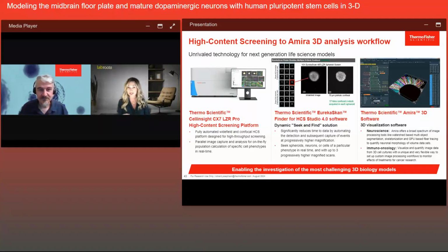We have time for one more question. Is there a recommended optimal size of neuroorganoid for passaging and imaging? So for these organoids, I never passage them. From the moment they're formed as a spheroid as PSC all the way out to 10 weeks later, they're not passaged because unfortunately you can dissociate them up to about 3 weeks and replate them onto an MEA, but beyond that you'll be killing the neurons.